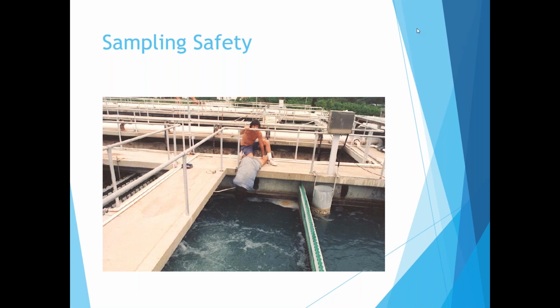That's fine. So when you document your temperature going forward, you'll have to remember that this is this much off from the NIST thermometer, and that needs to be documented on or near the thermometer. You could just take a piece of tape and wrap it around the top, make like a flag, and just write plus 3 degrees or minus however many degrees to know the difference that you need to take into account for the NIST thermometer.